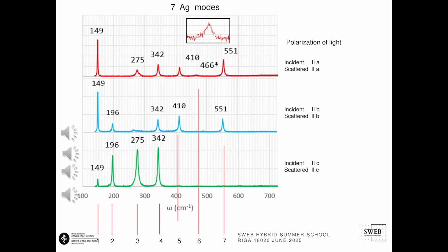You see the spectra with polarizations parallel to the 3 crystallographic axes on the slide. The intensities of the bands in the spectra vary greatly. This corresponds to the theoretically expected 7 modes. In the case of the YAP crystal, we have been successful and have obtained the Raman bands of all 7 Ag symmetry vibrations. This is often not the case.